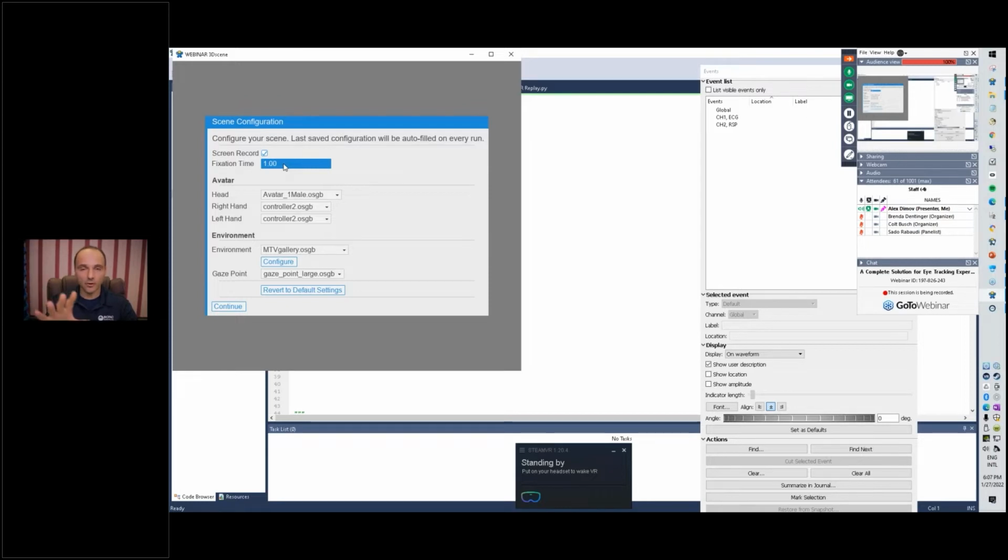So when we look at an object, let's say you look at a cat, if you look at the object for 1 second, it will be considered a fixation, or we could dial that down to 0.23 seconds. I'll leave it at 1 second so that everybody can follow along. So keep the fixations a bit longer. And we're going to choose an environment, and I'll go into how we actually make this happen later. Now it's just a number of pre-configured environments.